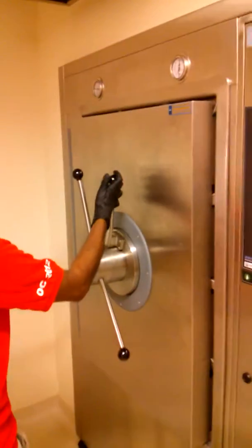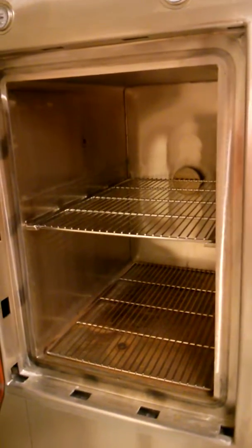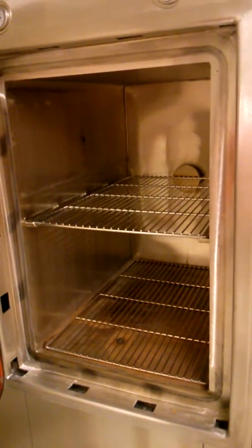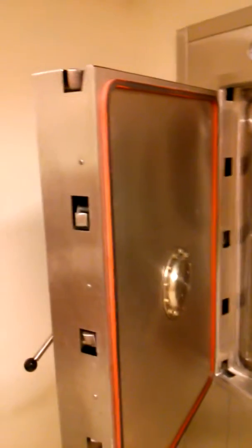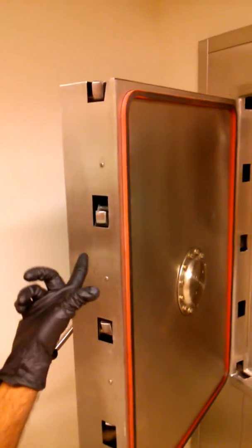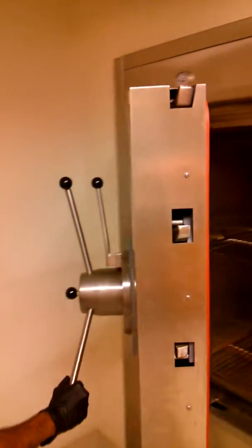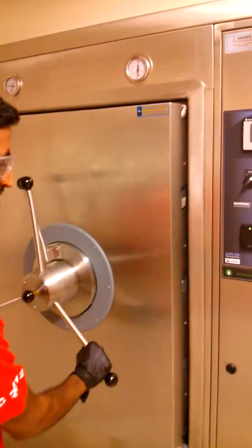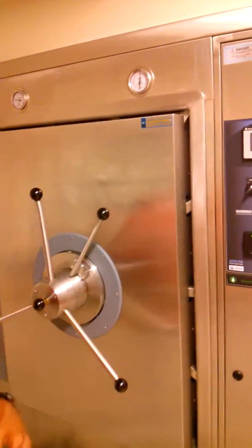If you're interested in seeing what an autoclave looks like, for those of you who haven't before, it looks like this. Now, especially if you've never worked with an autoclave before, be very careful and make sure you never touch anything. You can see that this metal is red hot. Always wear proper, appropriate hot gloves and other safety equipment.